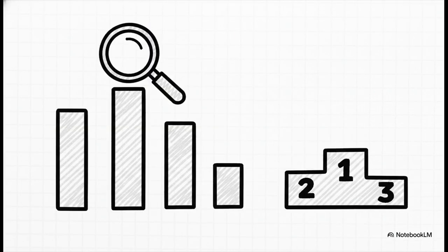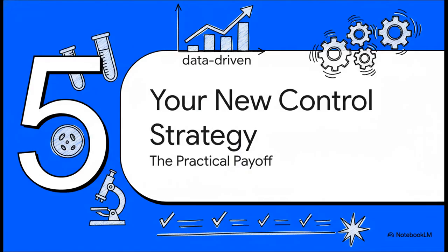And when it's time for analysis, keep it simple. Seriously, you're looking for a ranked list of effects. Which factors move the needle the most, and in which direction, up or down? The ultimate goal here is to create a top drivers list that tells you exactly where to focus all of your attention.